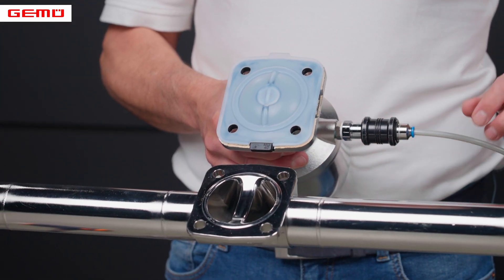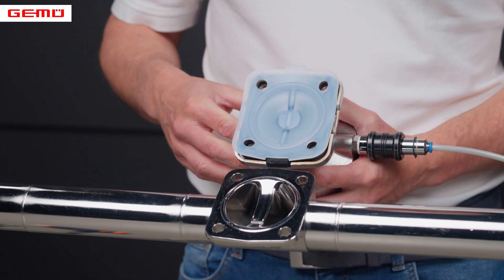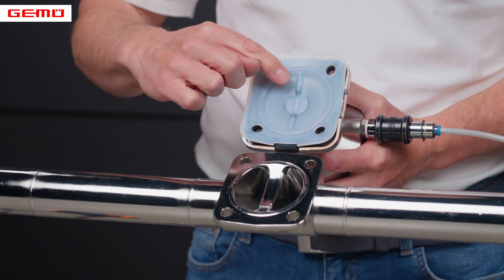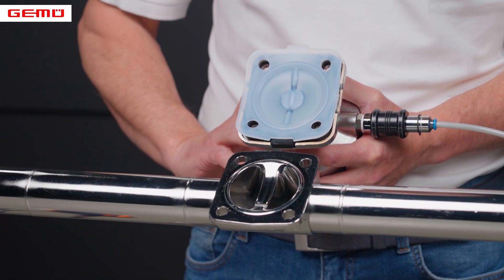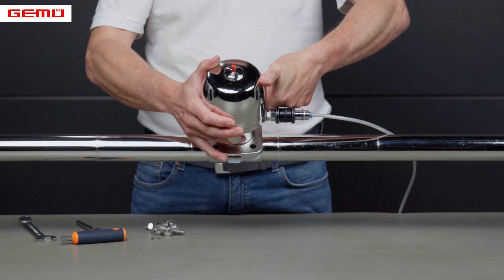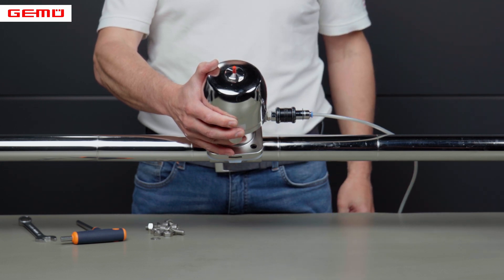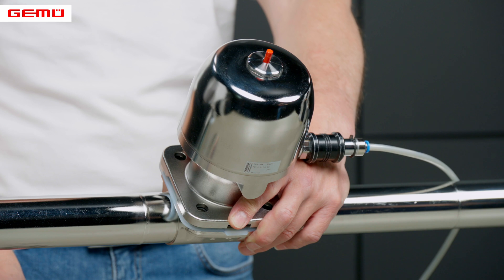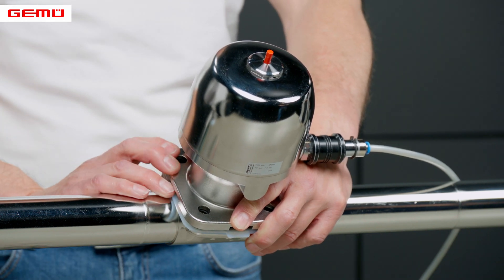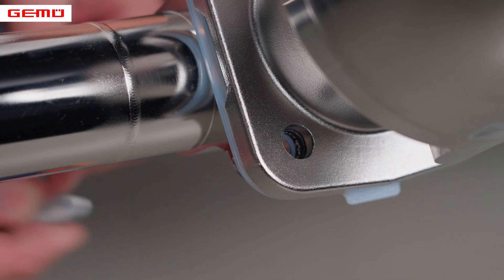The actuator is moved back to the open position. If you have assembled the diaphragm in the correct position, its seal contour will automatically be aligned with the sealing weir of the valve body. During assembly of the actuator, make sure that the control air connector is aligned in its previous position. The connecting bolts are inserted from the body side and hand tightened clockwise with the hexagon nuts. Washers should be used on both sides.